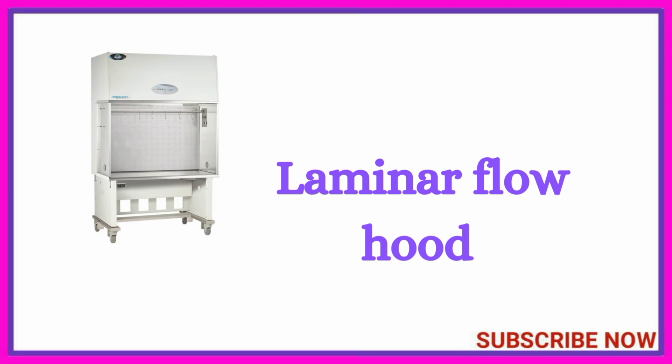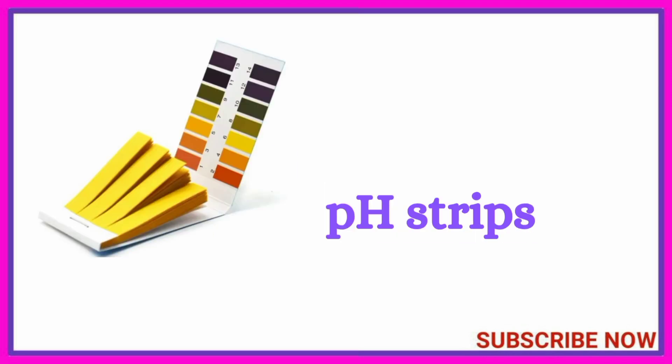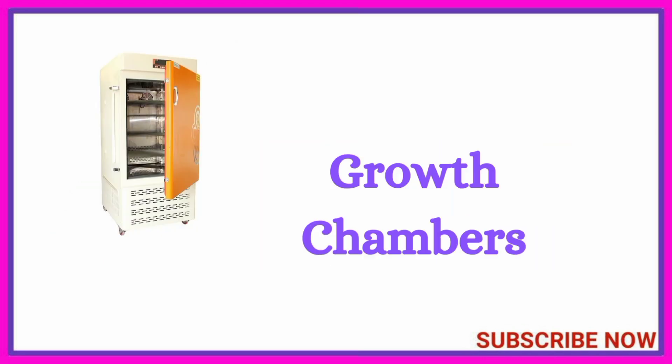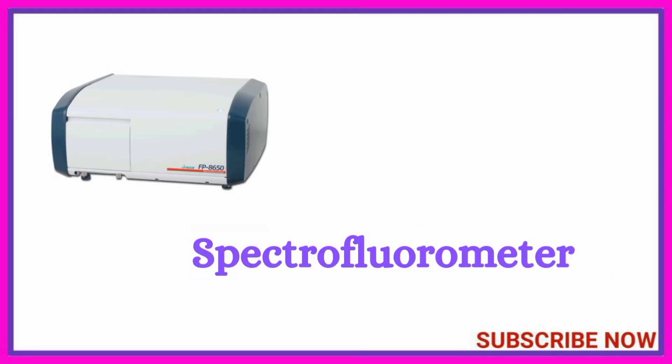Laminar flow hood, pH strips, growth chambers, blood pressure monitor, spectrofluorometer.